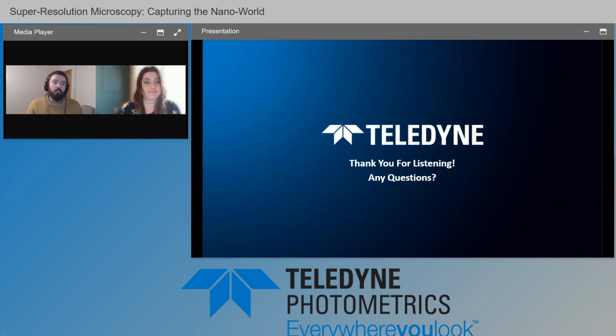Yes, a good question. So super resolution is essentially here to image smaller samples than you could with normal microscopy. But as you say, the same thing is achieved with electron microscopy. You can image even smaller still, down to the atomic scale, even with some systems. So electron microscopy definitely gives you the same benefits of super resolution microscopy.